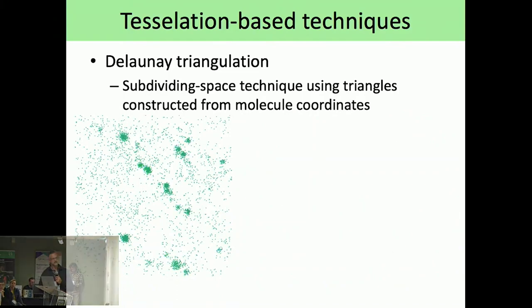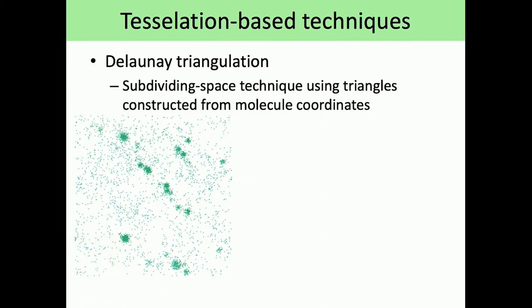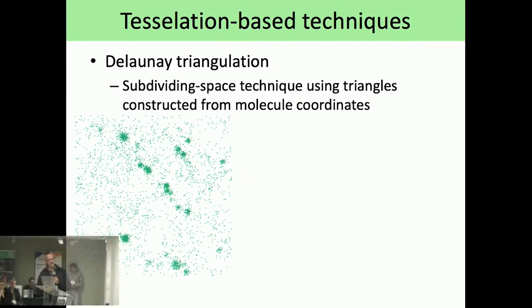So we and others thought about another approach, which is the tessellation-based technique. Actually, there was a technique that people were working on many years back, 20 to 30 years, in very different fields, like data compression, that I remember people working on in the lab during my PhD thesis, and I thought, and another group at the same time, that it's perfectly adapted to the single molecule field. So what are these techniques?